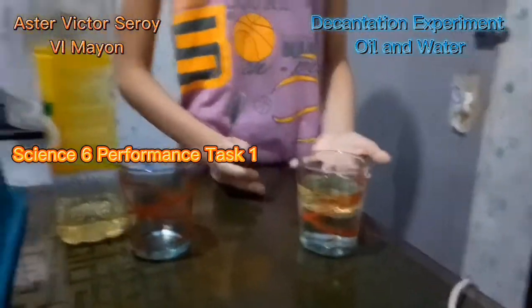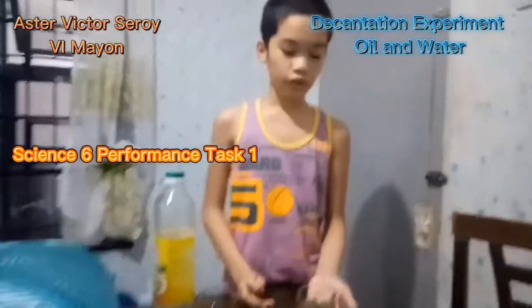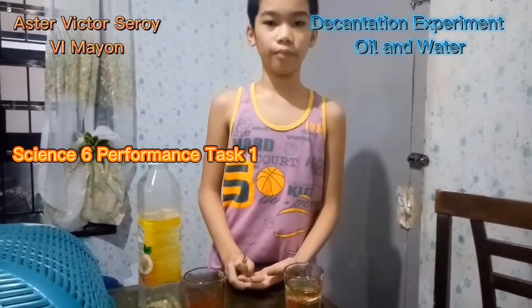Now, as I said, in the Decantation Method, its components are left undisturbed.